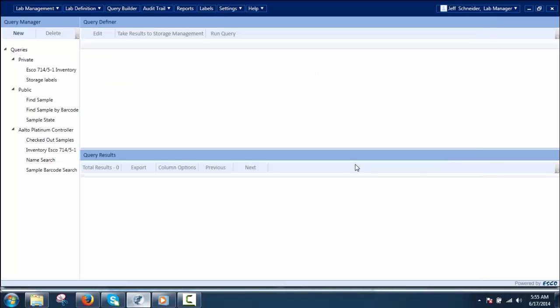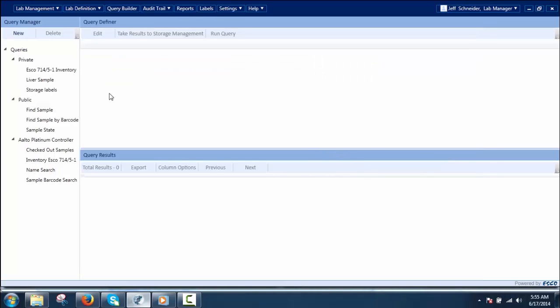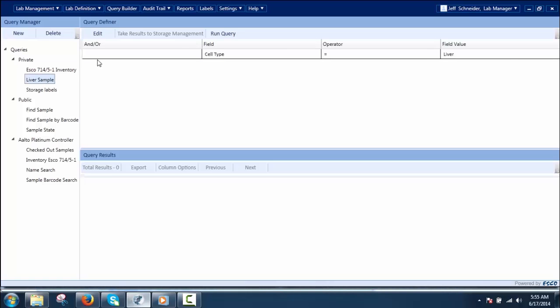To run a query, the user can select the saved query from the query list and click Run Query to see the results. The user can also navigate through all saved queries according to assigned privileges and view the definition of queries in the Query Definer pane.